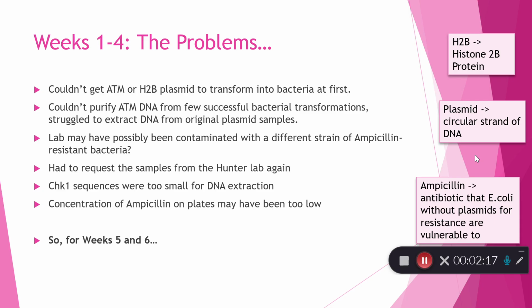So initially, we couldn't really get ATM or H2B plasmid to transform into bacteria. It just seemed to not be working for a while. But eventually, I could get ATM to transform into bacteria, or so I thought. However, after that, I wasn't able to purify any ATM DNA from the few successful bacterial transformations that I did have. And then when I went back to the original plasmid samples, I was struggling to extract any DNA from those either.